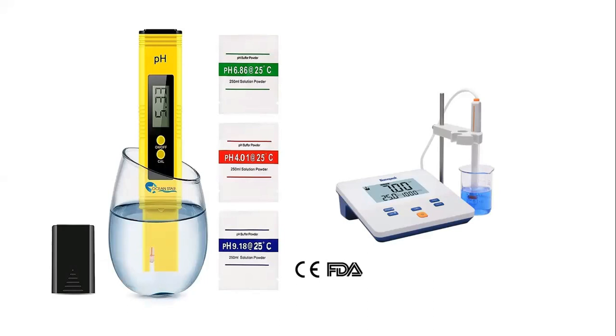I think on the right end, you have the multimeter with electrodes, and basically electrodes and a clamp just to hold the electrodes together. So as usual, you're going to take your water sample, shake it, and then pour it halfway into the beaker, and then rinse the electrodes using distilled water and immerse them into the sample for analysis. Switch on the multimeter and then take the pH reading. With this one, you can obtain the pH reading, the conductivity readings, and the temperature readings.